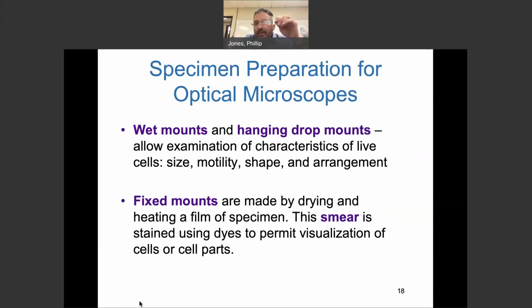Depending on how thick this was or how I made them, it was almost impossible to see the organism. And the point was, this is why we stain it. We can do a simple stain, which gives us just morphology or shape, or we can use a gram stain or a differential stain. It'll give us the shape and tell us something about the cell wall structure, or give us a little bit more information on what's going on.